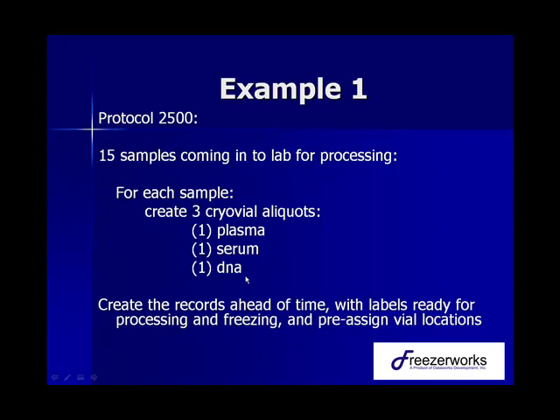We're going to create these records ahead of time so that we can print and have labels ready for processing and freezing. And we're going to pre-assign the vial locations. So let's go ahead and get started.